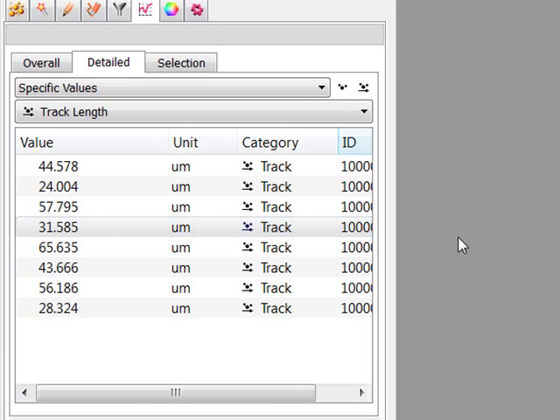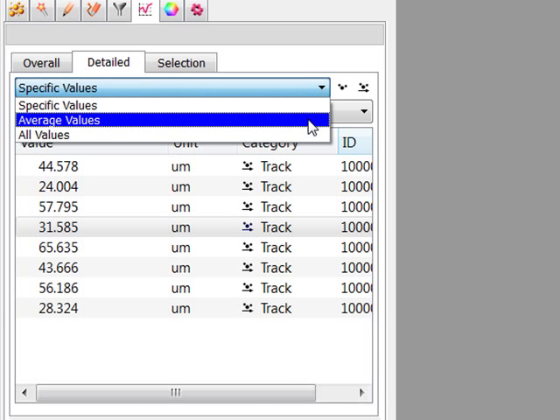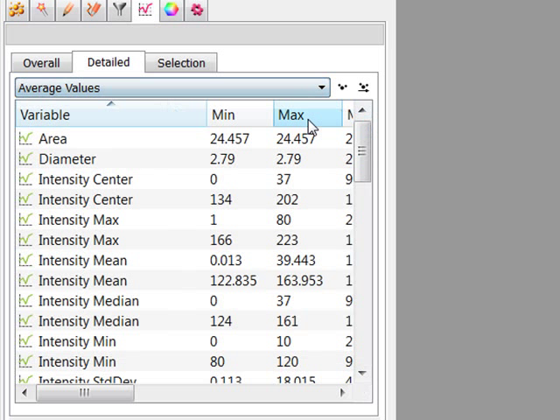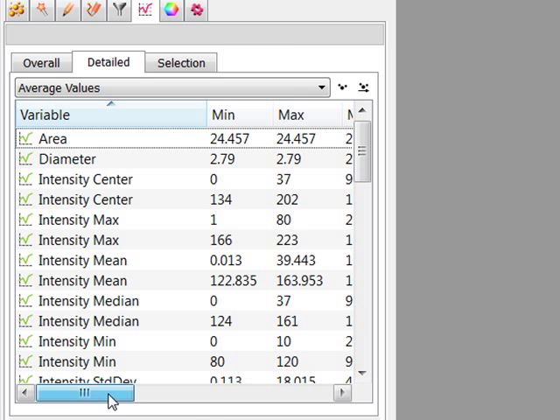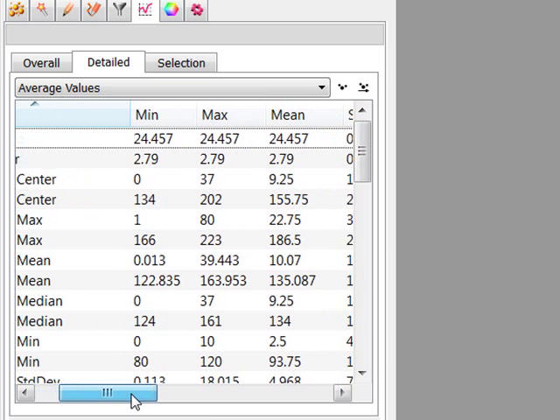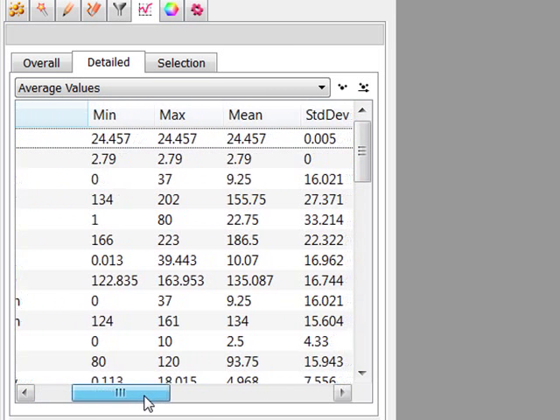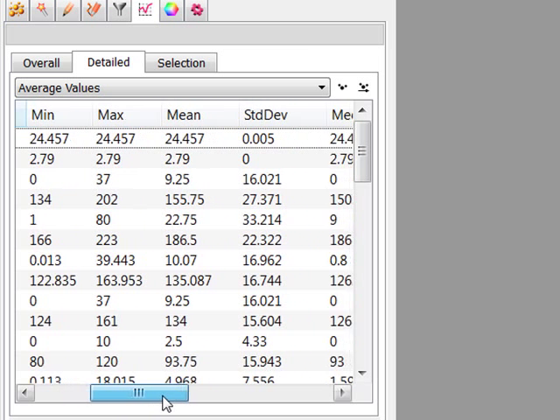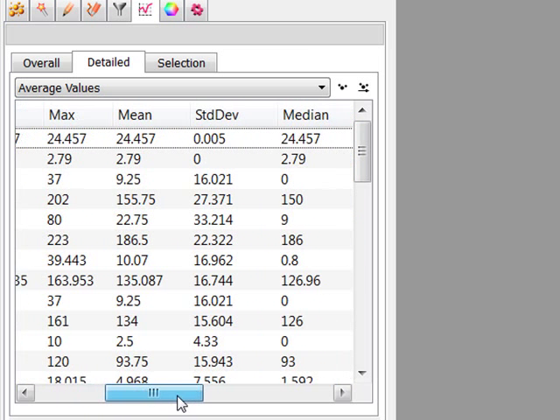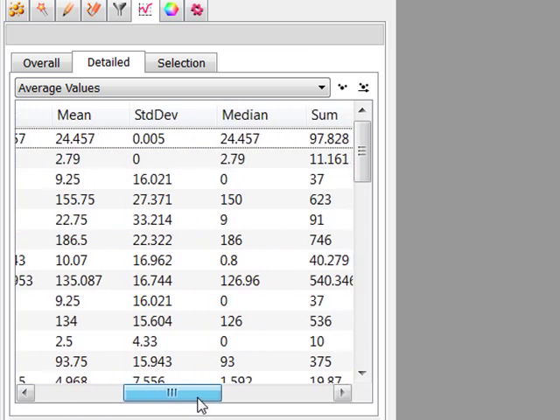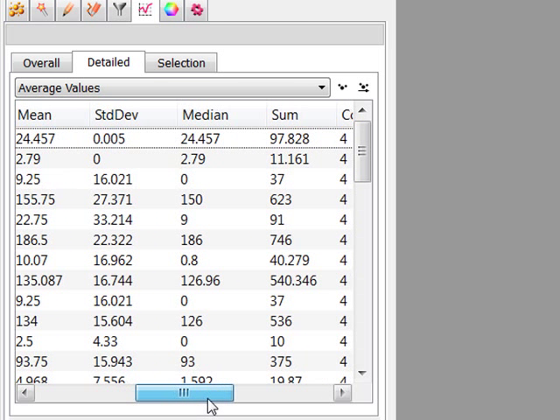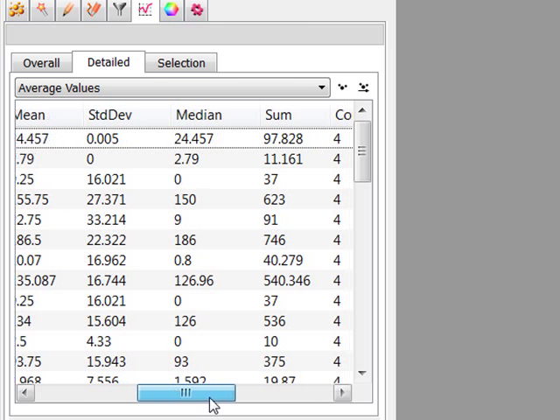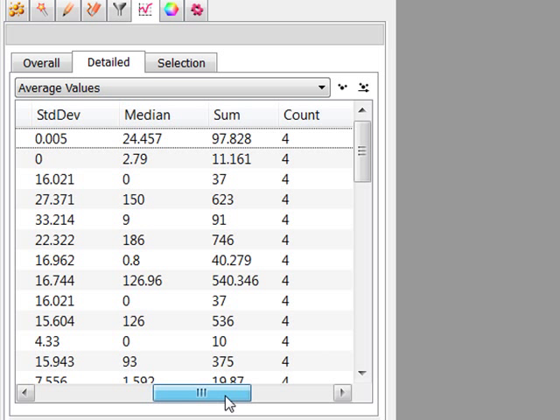The Average table contains values determined on the basis of all values within a set of the selected variable. In the Average statistical table, the columns present the five value summaries – Minimum, Maximum, Mean, Median, and Standard Deviation. In addition, the sum and total number of all values are given.